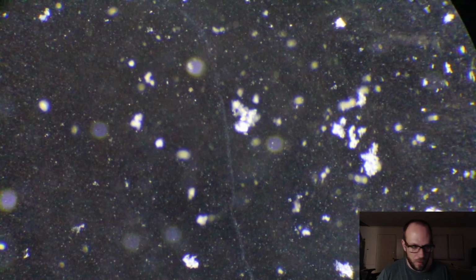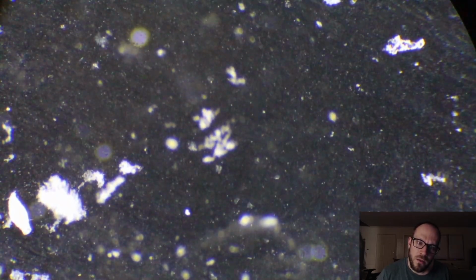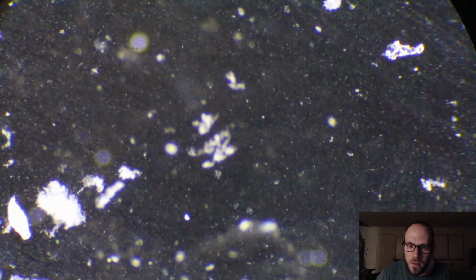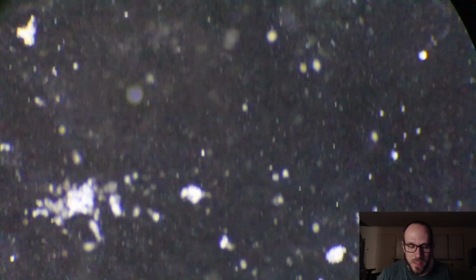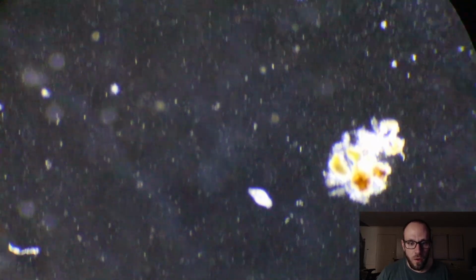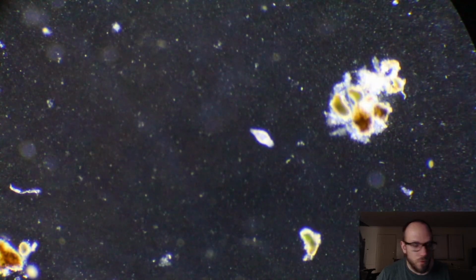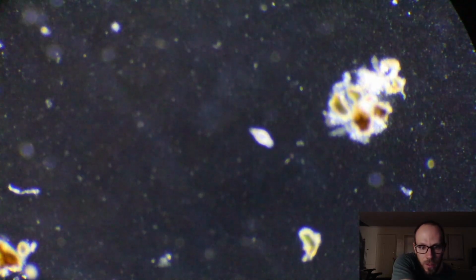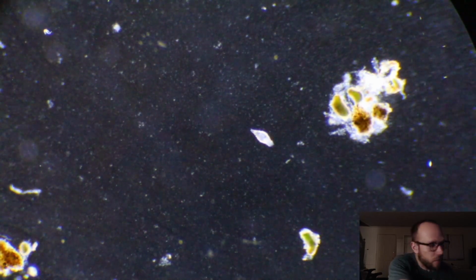Switch back to dark field. Open up the aperture. What the hell? There's nothing up. Just tiny... Okay, so you see tiny little guys swimming. That's it. I have been tirelessly searching for... Oh! Hello! A Rotifer! Finally, I see something I'm familiar with. Are you alive?